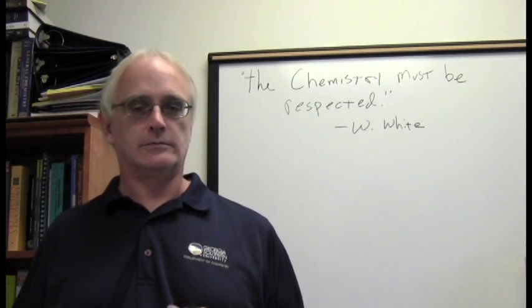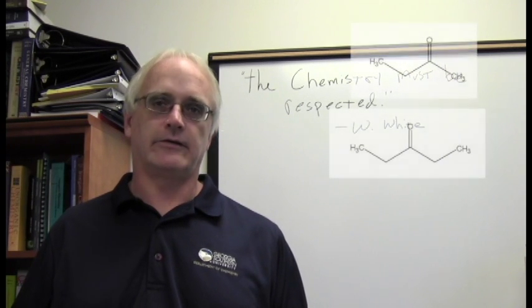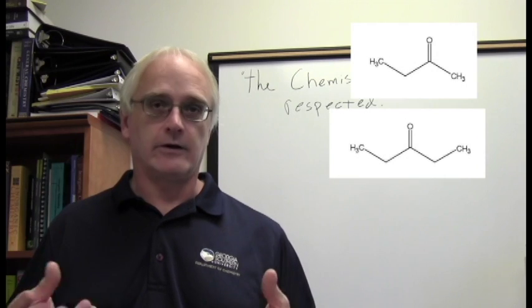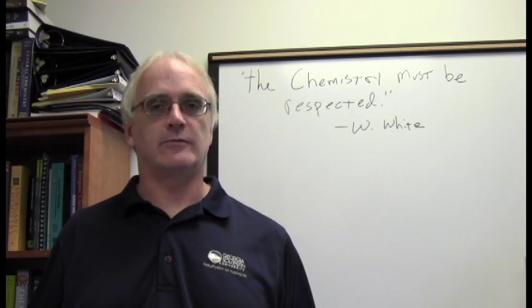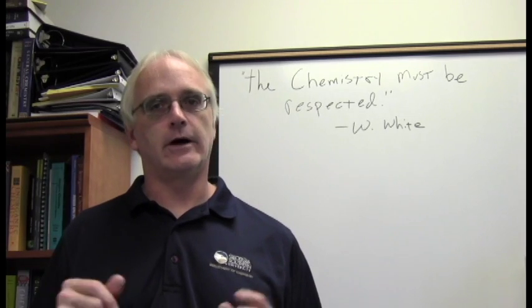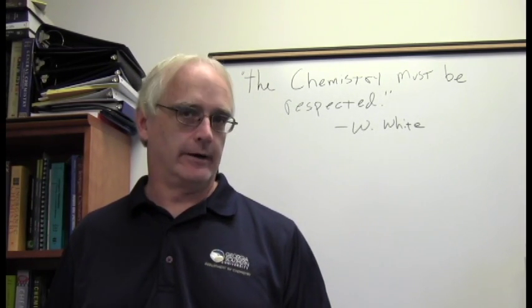Together, these 2 fairly simple example molecules nicely illustrate the connection between the number of distinct groups that a molecule will feature, how molecular symmetry can drastically change the expected number of groups, and how each distinct group, proton or carbon, will form a distinct resonance that we can see in our NMR spectra.